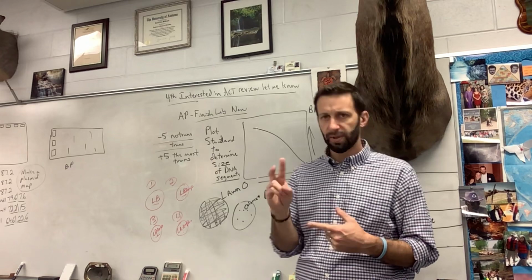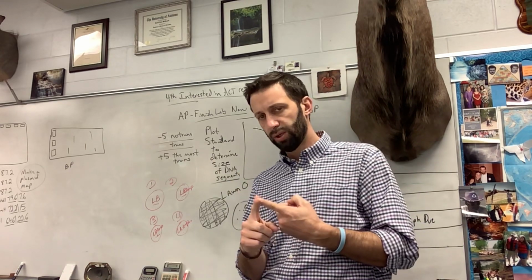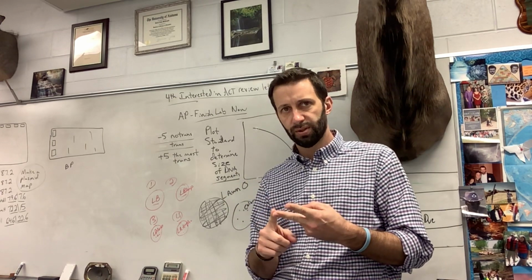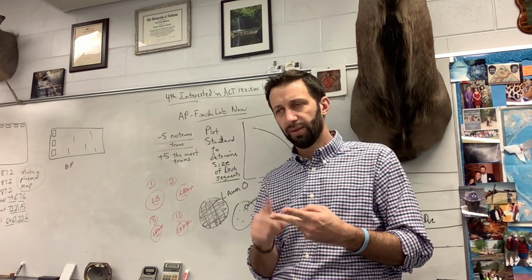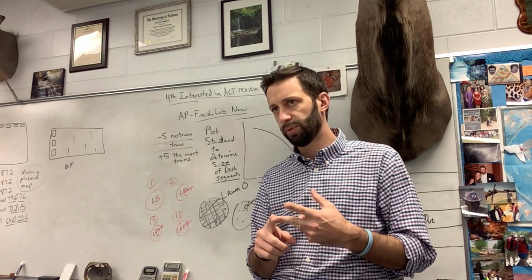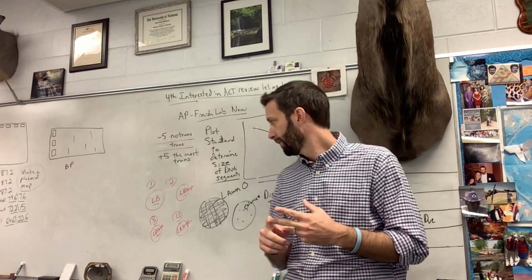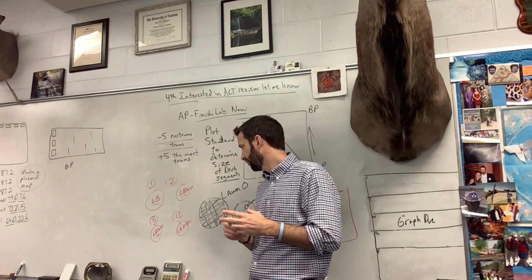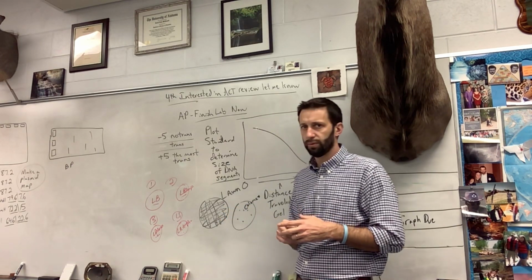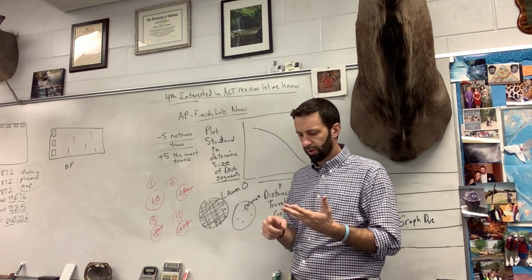Now remember, the plasmid had 2 important things. It had the Pglo gene for fluorescence, so it would glow, and it had an ampicillin resistance gene. So in these negative petri dishes, you did not have the plasmid mixed in with the bacteria. So what do you expect to have in number 2? No growth, lawn, colonies.